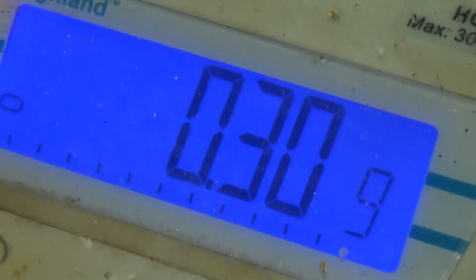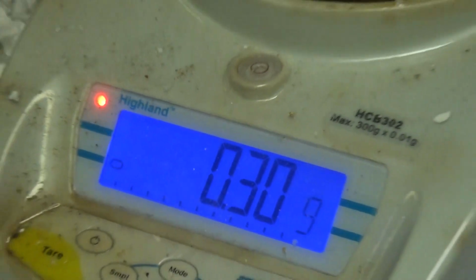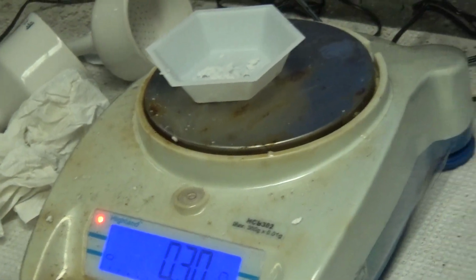So it's 0.3? 0.3, so it was what, 0.94? Yeah. Crude product? 0.94 and now it's 0.3, so lost about a third, or they got about a third out.